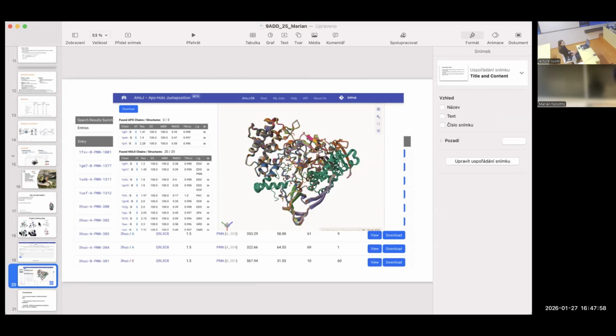It would be something like apo-holo, holo-holo, apo, or something in the most extreme cases. So we try to define this apo-holo not for protein, but per binding site. That way you can get a list of structures in a given binding site, which are apo, which are holo, what is the ligand binding there, and some characteristics of how much they differ. We could go into this, but we will probably not have time, maybe later when we will be trying these things.